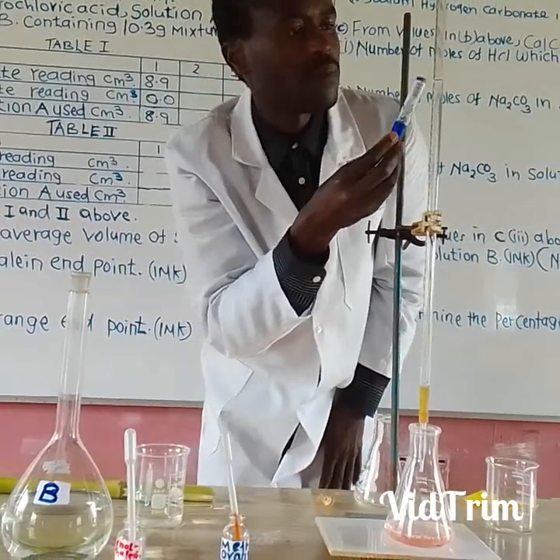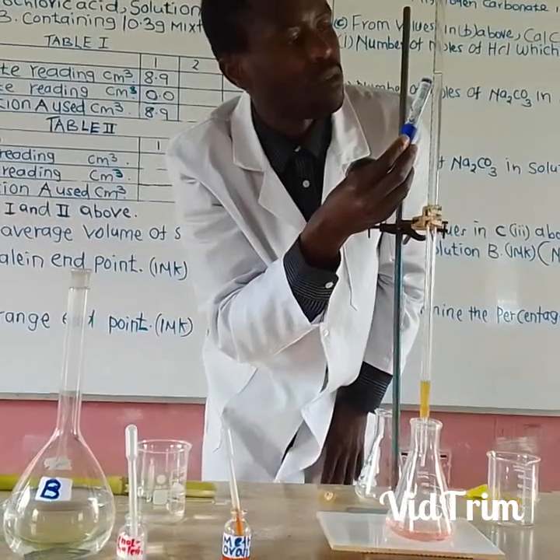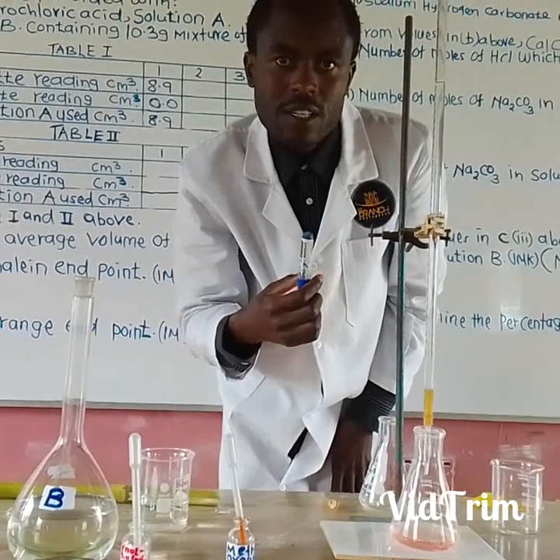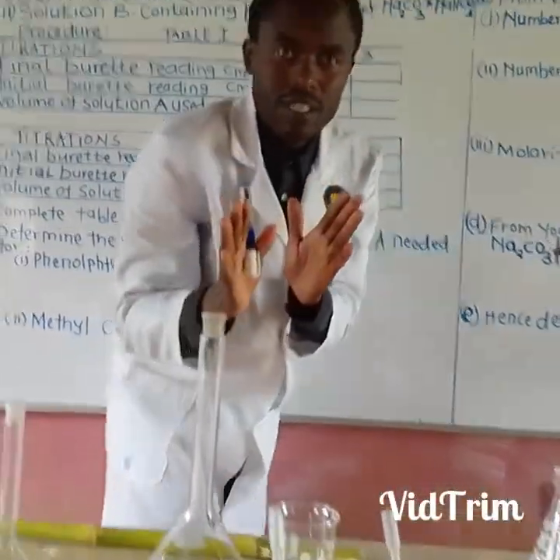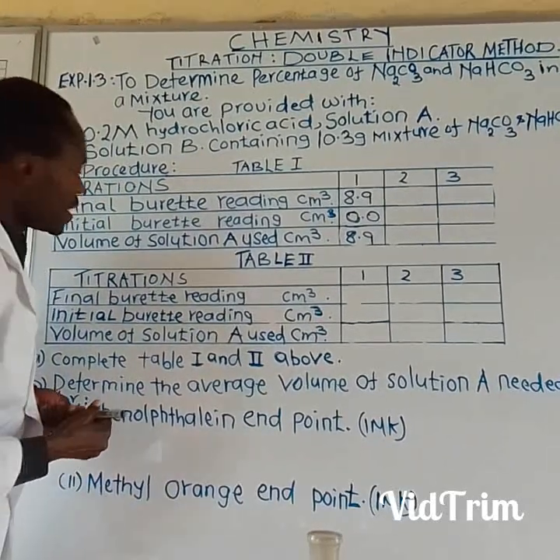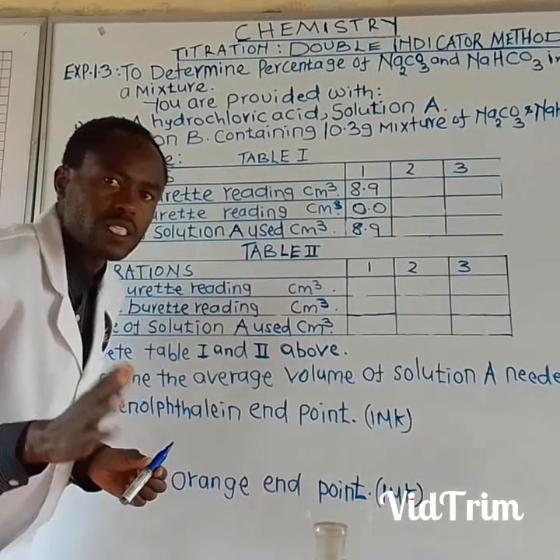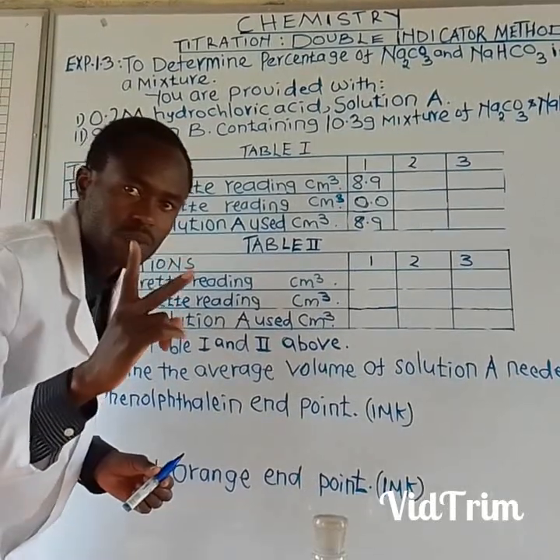Let me see. This is 22.9. It is 22.9. So focus, my student. Just be slow and focus. So I said, when now you use methyl orange, we move to complete now table 2.